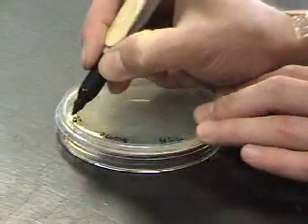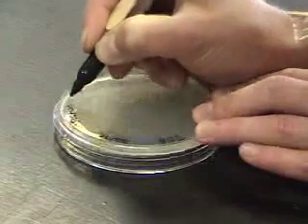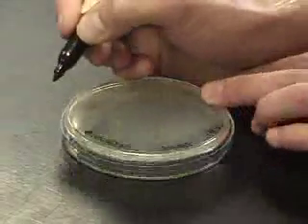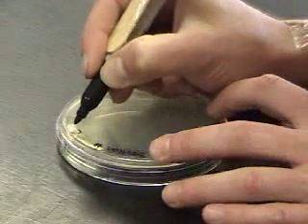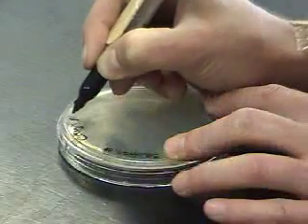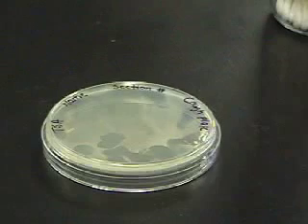On the first TSA plate, as with the second, you'll want to label your name, your section number, and the identity of what's on the plate. Label one as your cough plate and the other as your streak plate. Notice that the labeling is on the edges of the agar so that any growth on the plate will be visible.